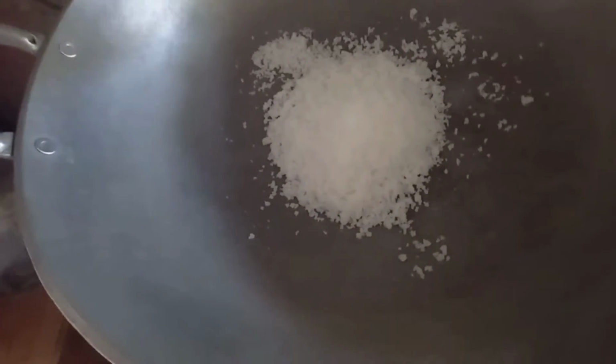First is to put salt in and mix salt and water. We need to mix this truly to do this experiment.